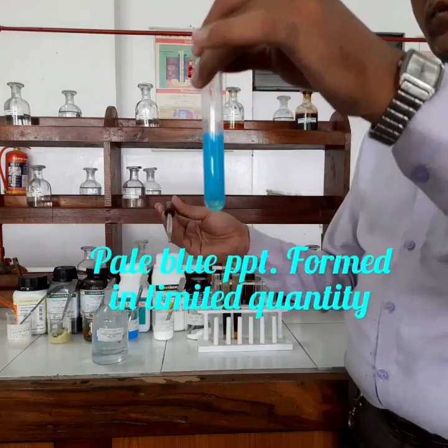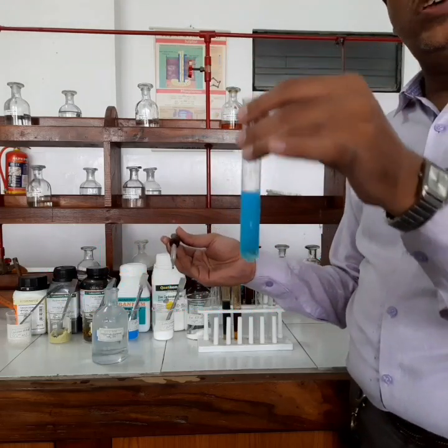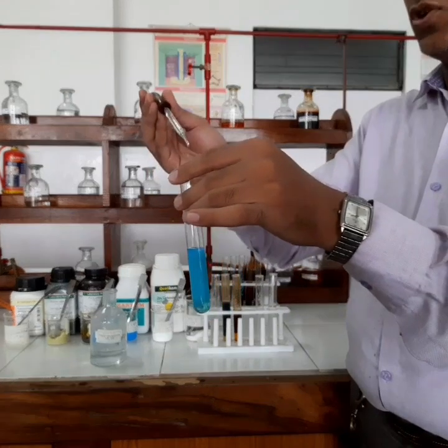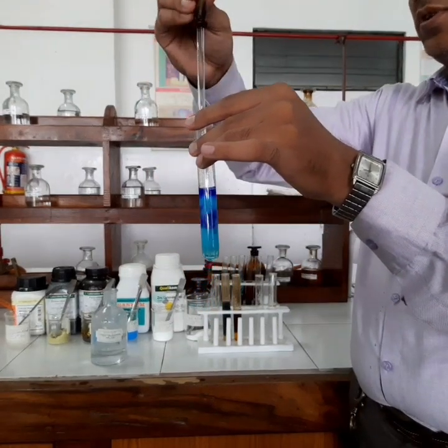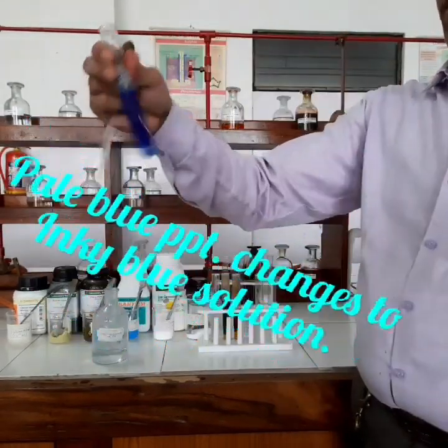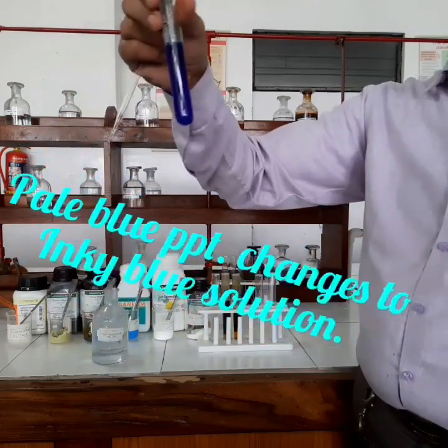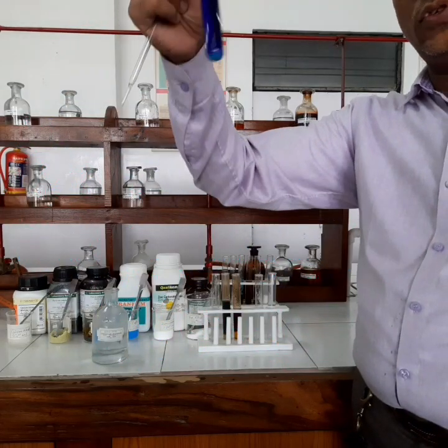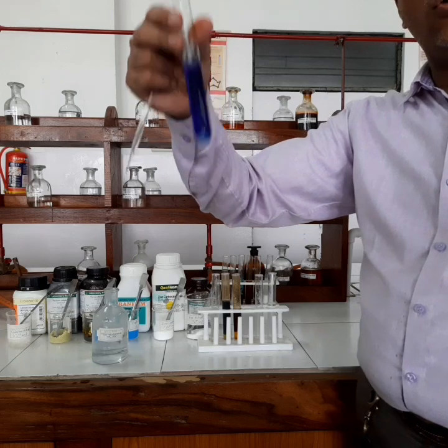But this precipitate will become soluble and will change to an inky blue solution because of the formation of tetraamine copper(II) sulfate, which is a complex salt and which is a soluble salt. So as you can see, when I have added ammonium hydroxide in excess, this precipitate which was pale blue has turned into an inky blue solution of soluble tetraamine copper(II) sulfate.